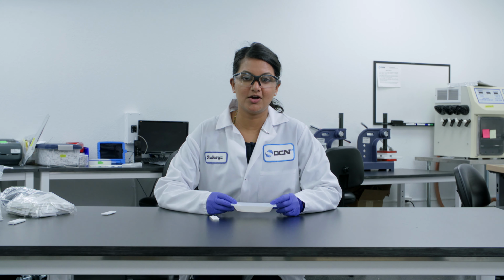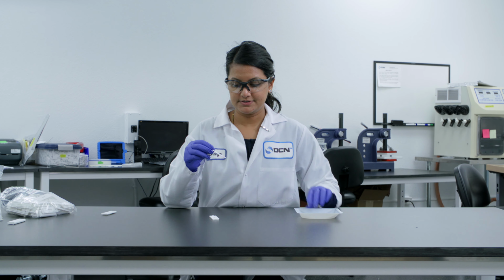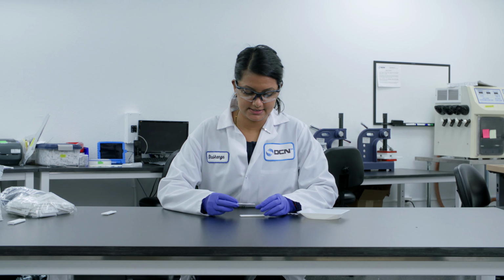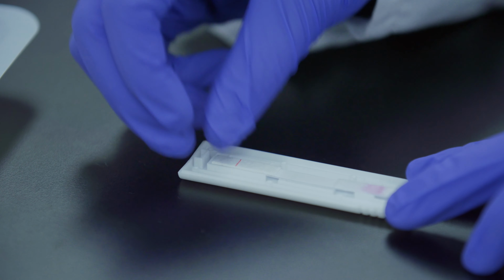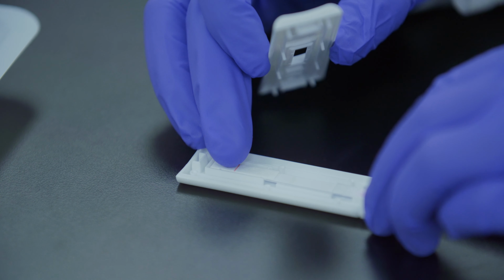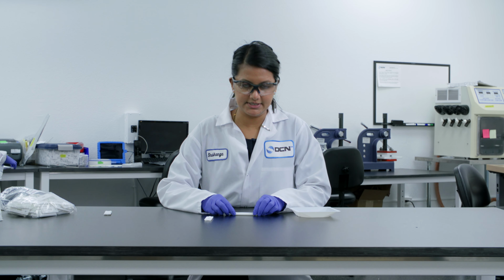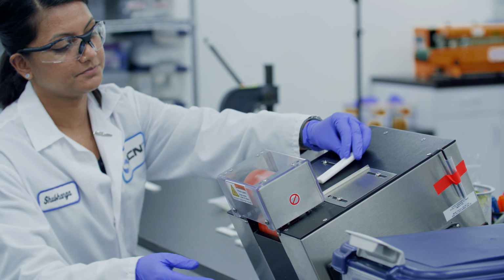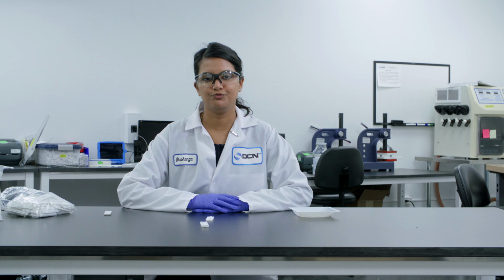So now that we've cut our card, we have our lateral flow strip, and we are almost done. So at this point, we will place it into the cassette or some sort of device. And at this point is kind of where things start looking like finished products out there. And we'll have a sample port where we'll put our liquid, and then we have a window where we'll see either 1 line or 2 lines. And you can close it either with a mallet or through this cassette roller. And you have your assembled device ready to run.